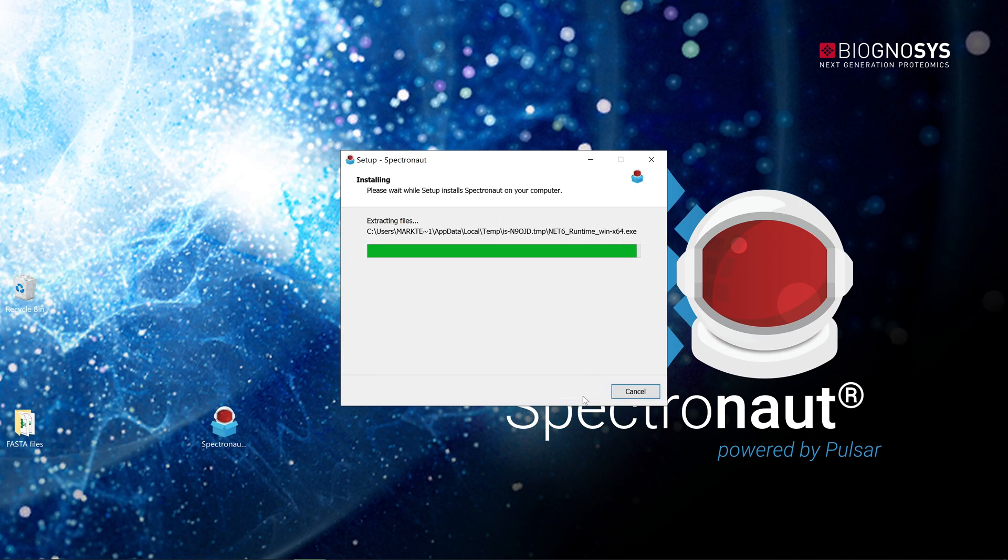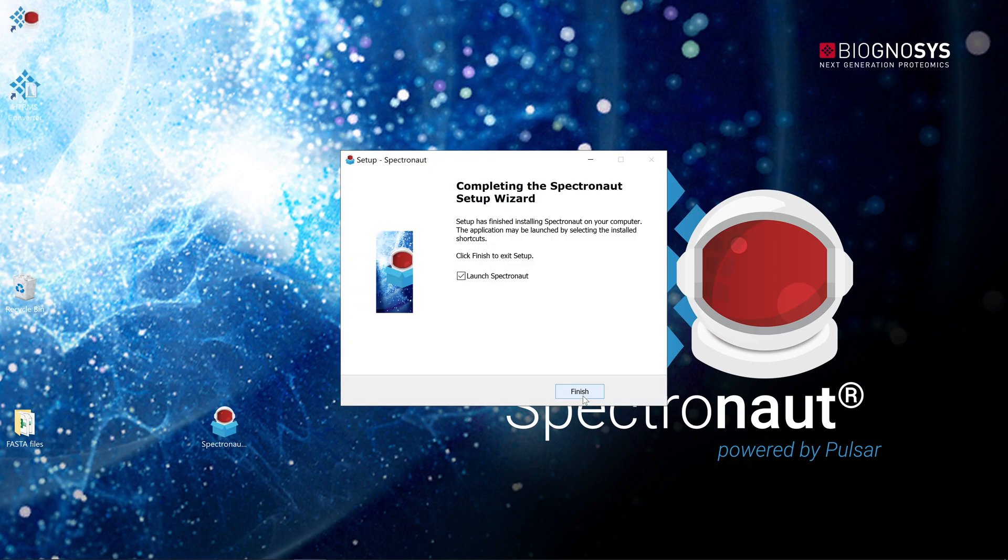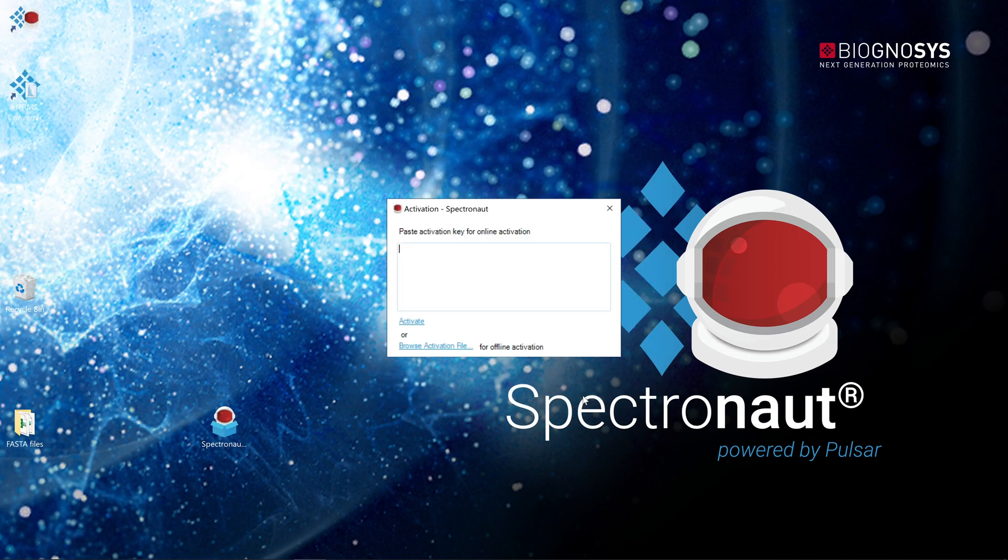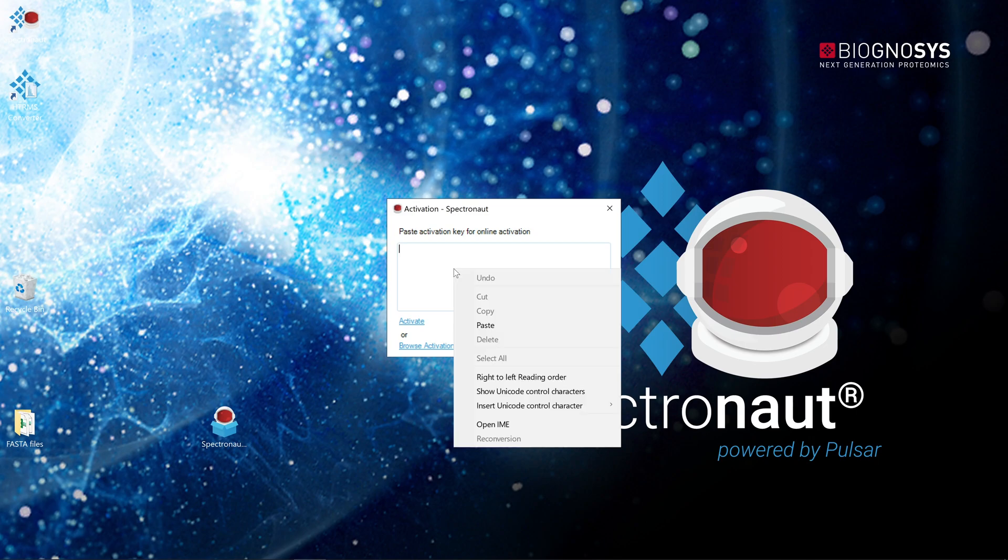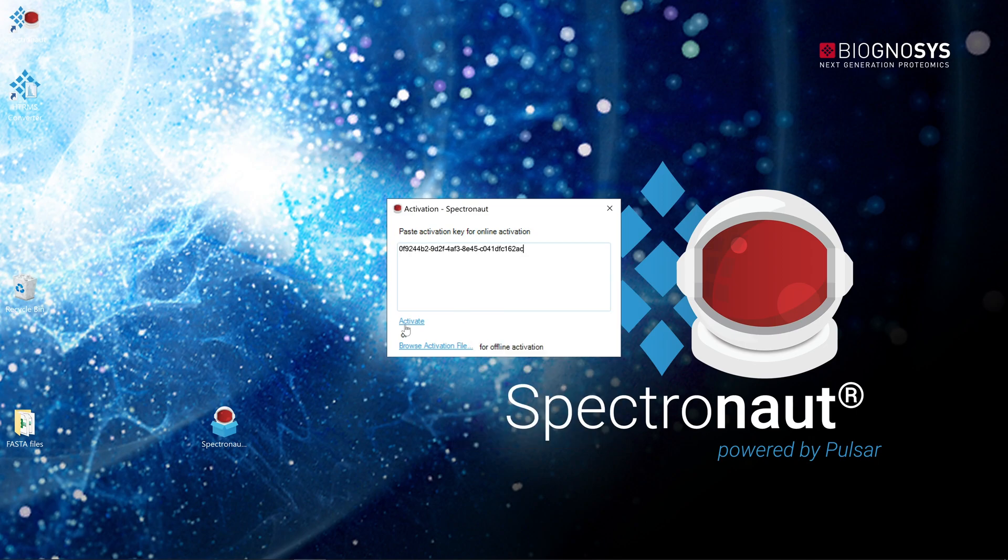After finishing the installation, launch the software to activate it with an individual activation key. If the computer can reach our servers, activation will be automatic.